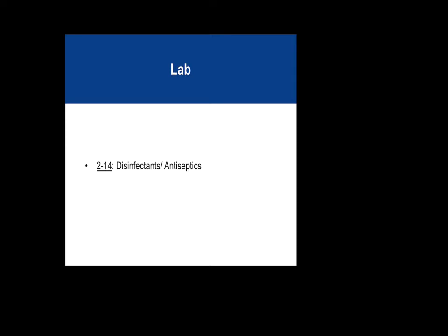For this lab, we are going to be looking at disinfectants and antiseptics. This is such a cool lab to do in the actual lab classroom, because what we end up doing is having you guys bring in all different kinds of disinfectants and antiseptics. Things that I encourage you to bring in are things that you use in the home, something that you use to clean a surface or part of the body that you would expect to be a disinfectant or an antiseptic. And so I tend to have students bring in some cool samples, anything from Windex to 409.